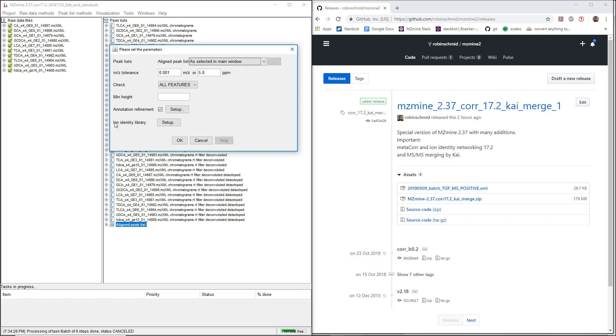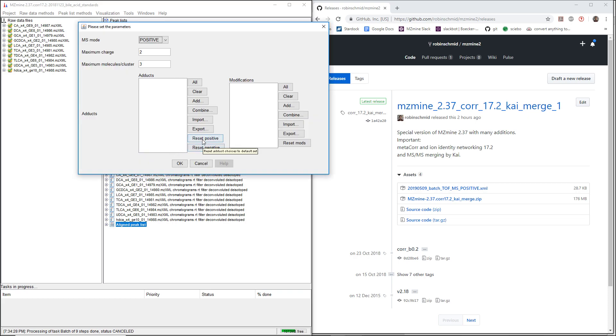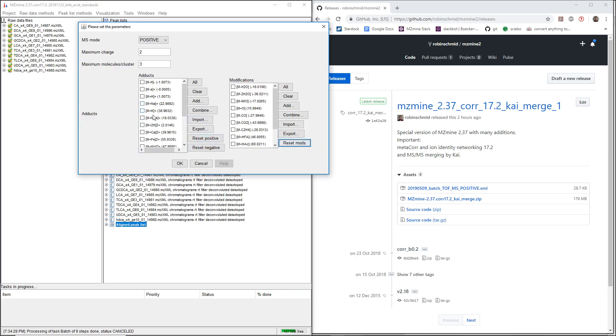Then we have ion identity library, where we can select the different adducts and the different in-source fragments. We're also going to have another video on this.